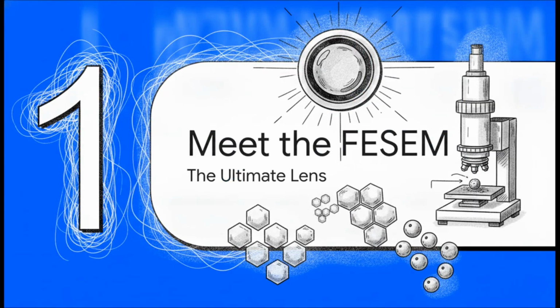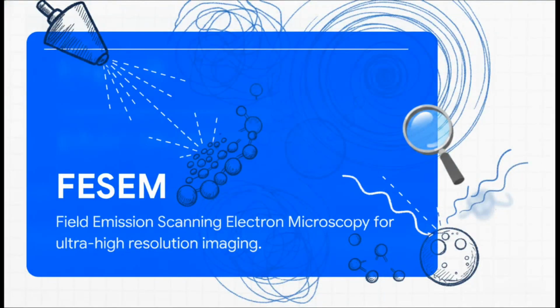Moving to Section 1. Meet the FESEM, the ultimate nanoscale lens. So, FESEM stands for Field Emission Scanning Electron Microscopy. I know that is quite a mouthful, but the core concept is actually brilliantly elegant. Instead of bouncing regular light off a sample to see it, this specific microscopy technique utilizes a highly specialized field emission electron gun. Think of it like painting the surface of an object with an ultrafine stream of electrons instead of just washing it with broad beams of light. Because electrons have much, much shorter wavelengths than visible light, we get to bypass the limits of traditional optics entirely, providing ultra-high-resolution imaging and precise structural analysis.